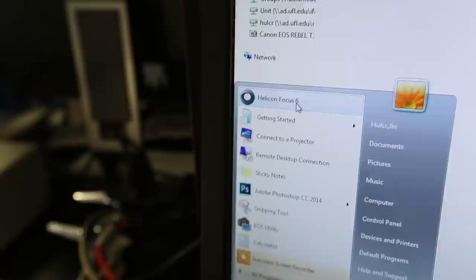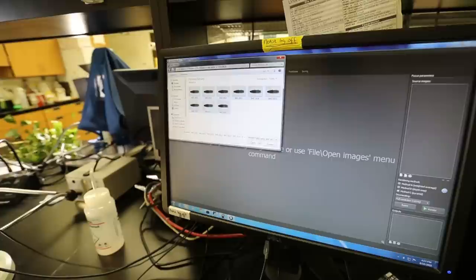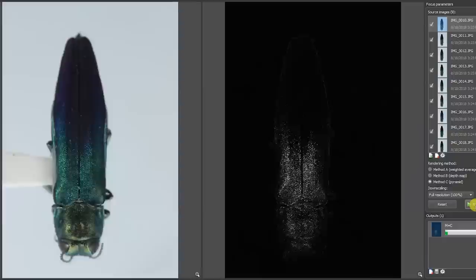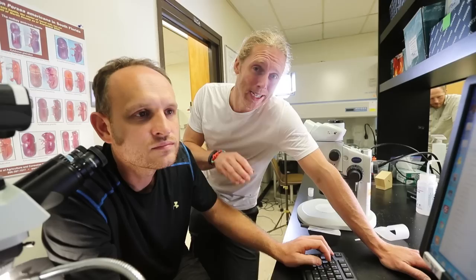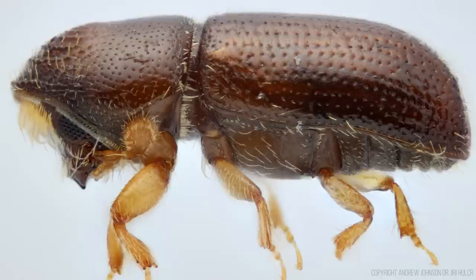All right, and the final thing is stacking them, and that requires a special program. The stacking program they use is called Helicon Focus. The program is inexpensive, and will let you drop in every image, click a single button, and then it automatically stacks them all together. Look at that. Oh, man. Are you kidding me? Look at the antenna. But this is only really scratching the surface of the capabilities of this microscope. We can zoom in and show you the individual eyes. And these guys take a lot of photographs of some really, really tiny stuff.